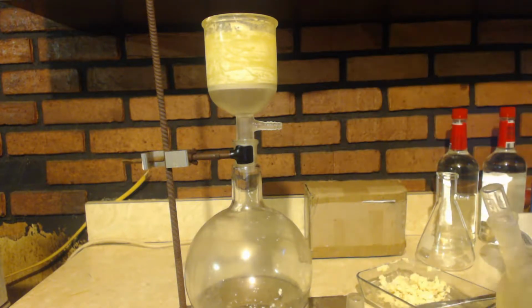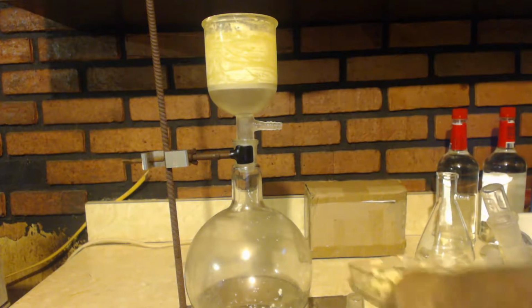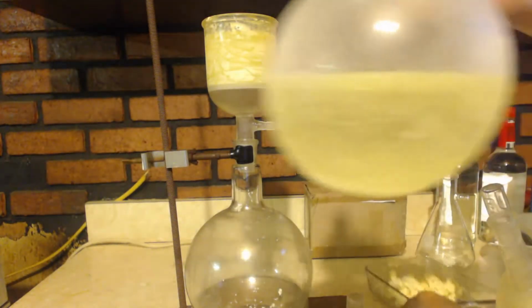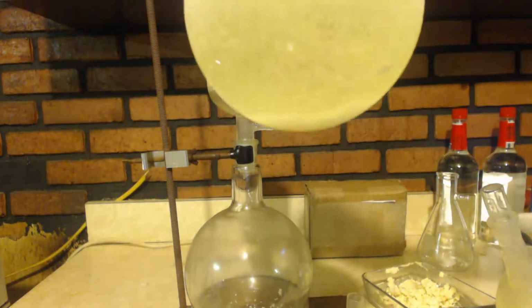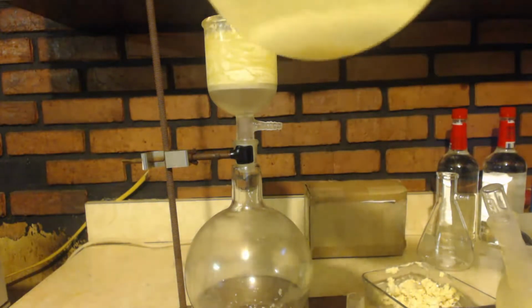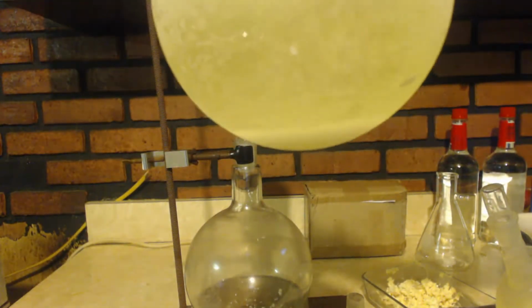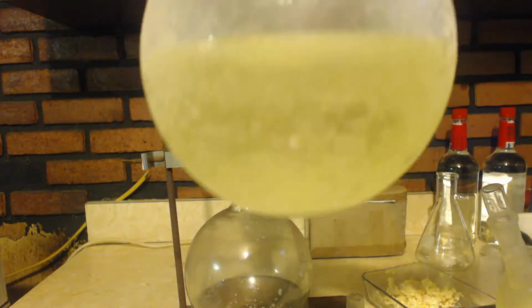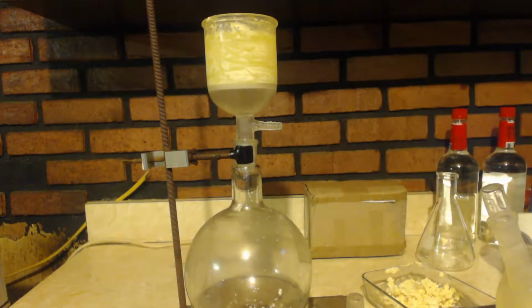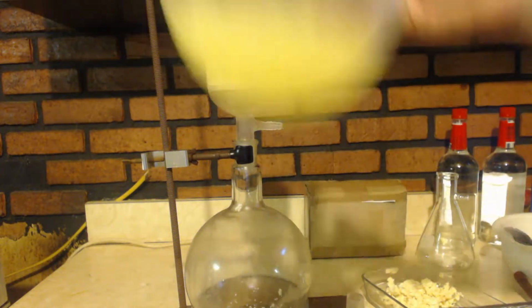But I want to show you something else. Now that was the water that I put through to wash this when I got it out. This is the actual nitric acid stuff and the xylene. You can see there's precip at the bottom. Now this won't freeze because it's acid. But there's stuff in there. I'll filter that next.